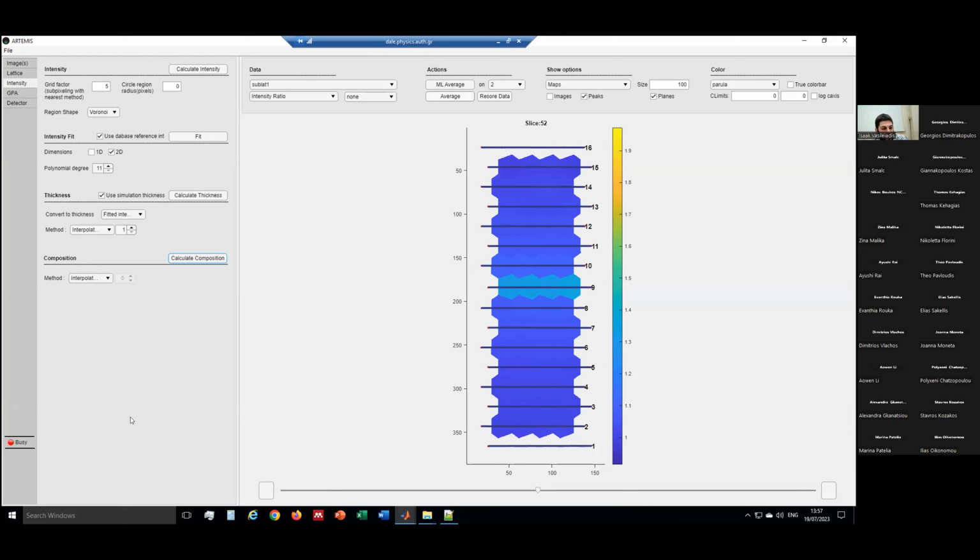If you want to ask something while we have time, I'm open for questions. Isaac. Yes. Hello, Julita. Hi. I would like to ask about this because next to this InGaN monolayer, there is visible like an extra layer. Is it nitrogen or what is it actually? Okay, exactly, close to the central quantum well. Yes, it's nitrogen. Okay, so this is nitrogen. And why is it visible for this monolayer and not visible for others?